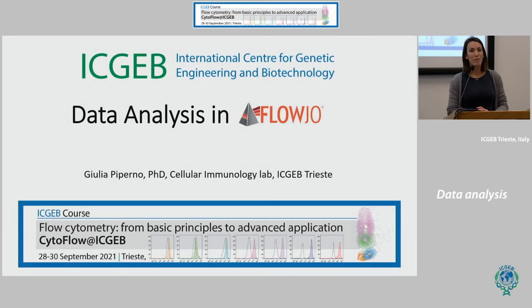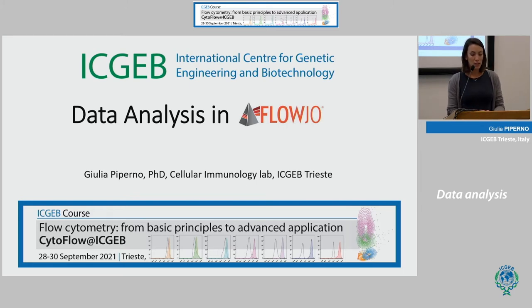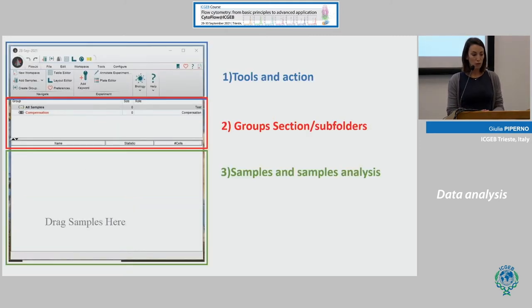Good afternoon everyone. Following the tutorial on how to prepare and acquire samples at flow cytometry machines, today I want to give you an introduction on how to analyze data using FlowJo. This is the workspace that you see when you open FlowJo.